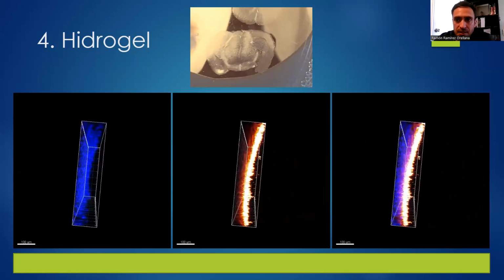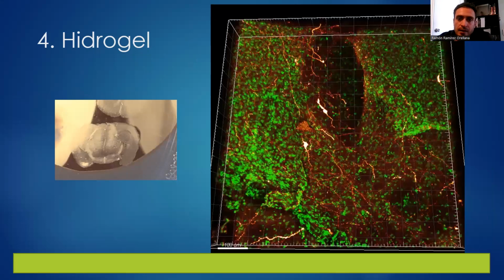Con otro grupo de investigación que también están desarrollando Clarity, hemos ido complementando y encontrando algunas soluciones respecto a estos inconvenientes que se han tenido al desarrollar esta técnica. ¿Ya?